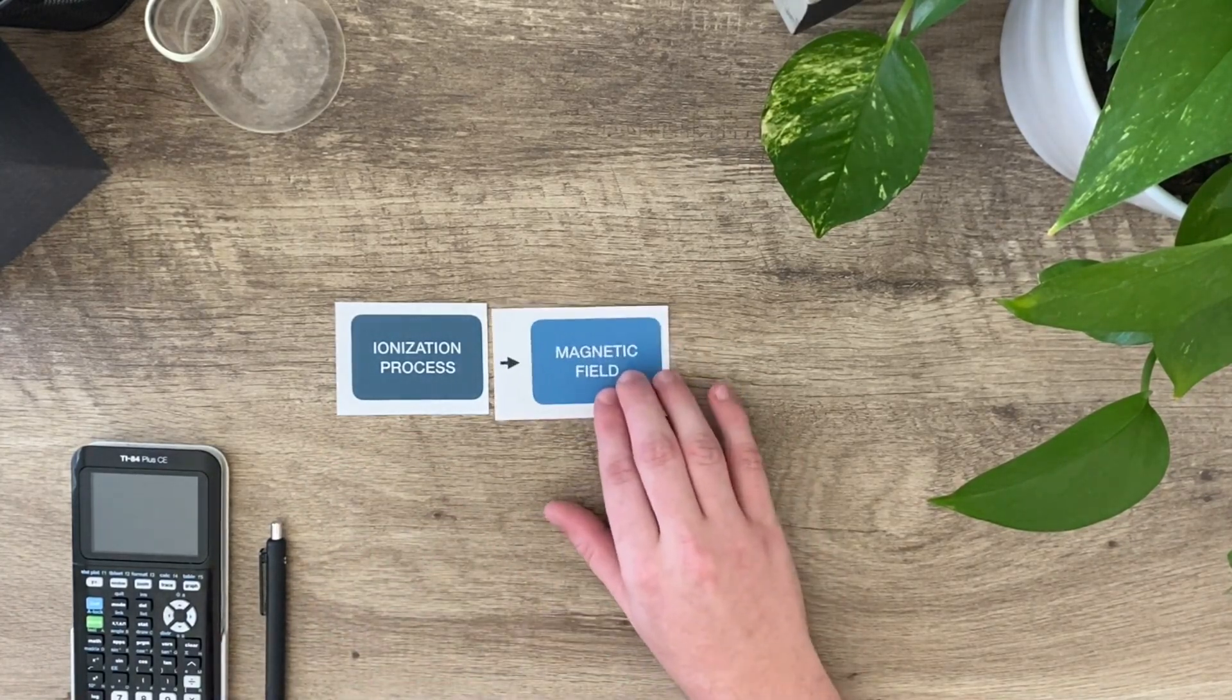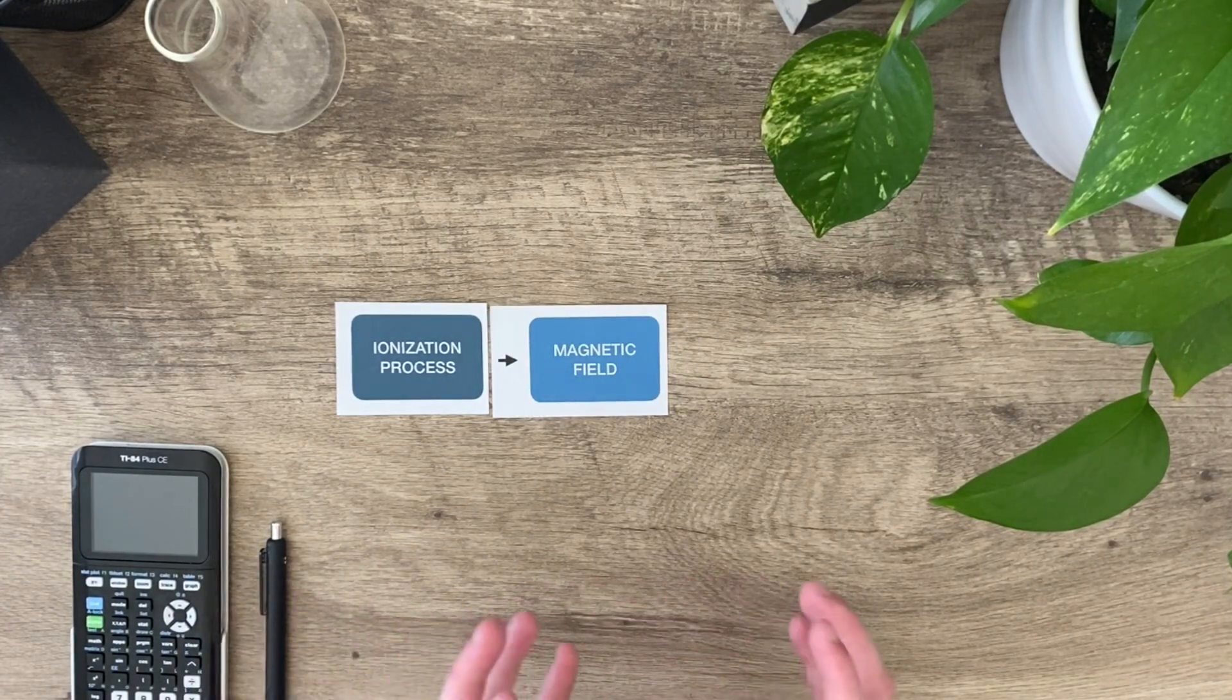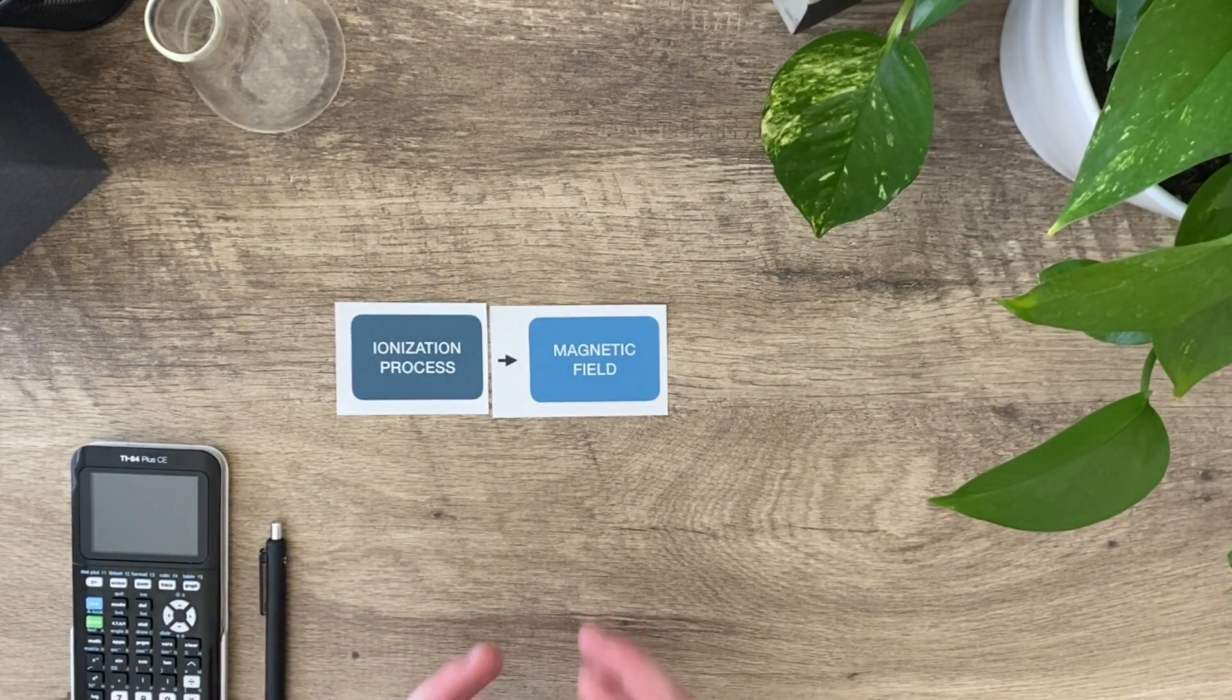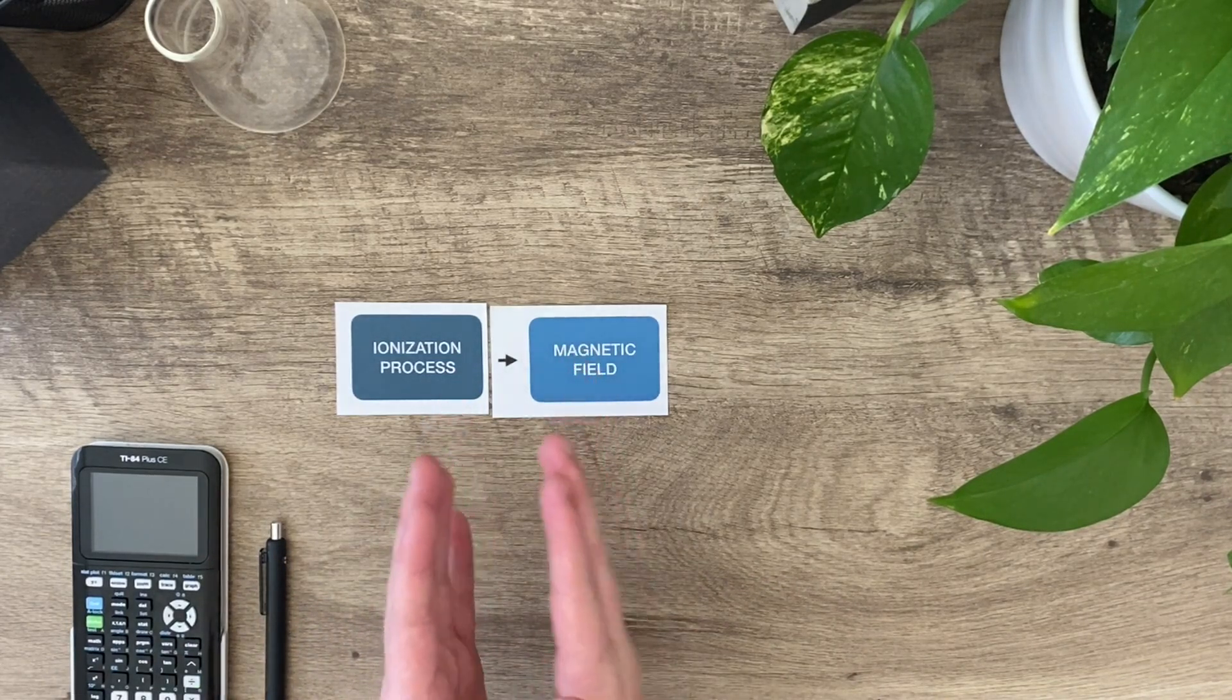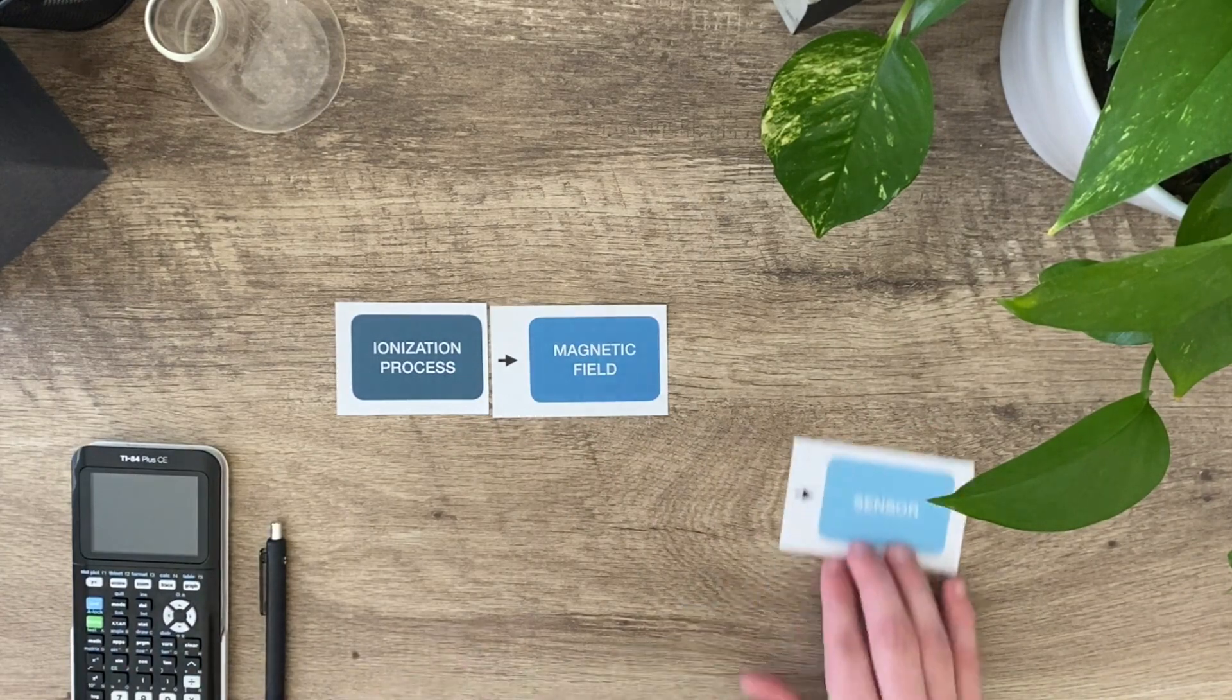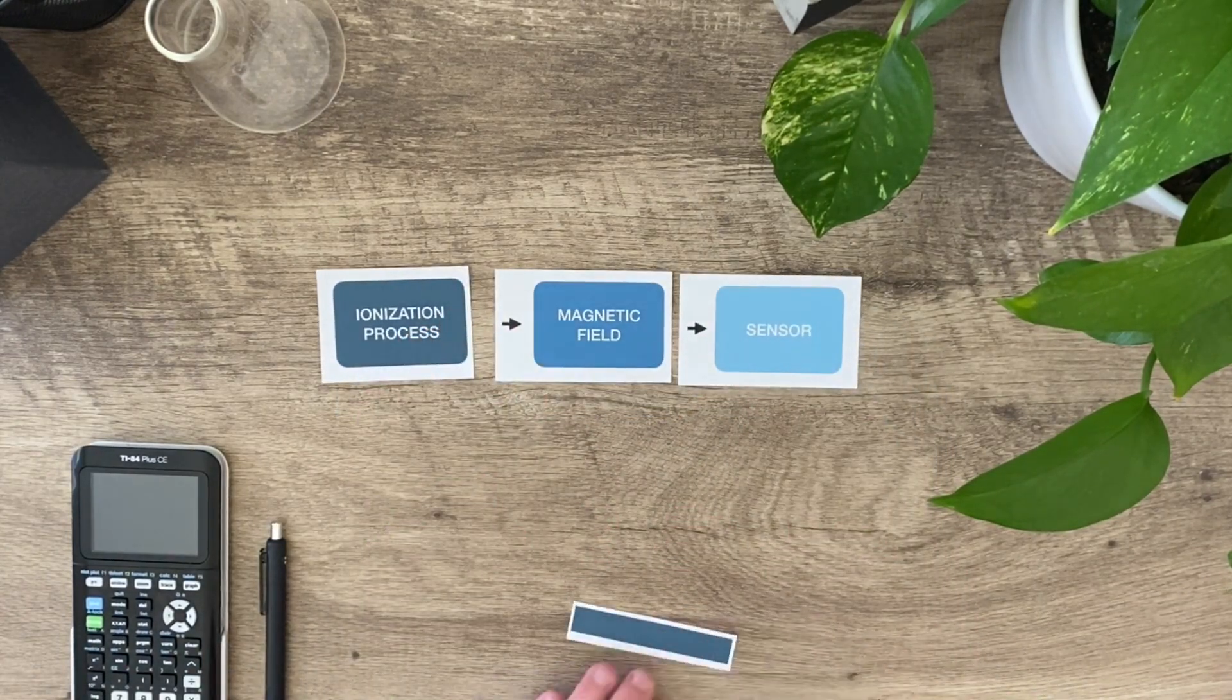The second part is that they're going to push those ions through a magnetic field, and the variation in that magnetic field causes the particles to sway left or right and deviate from the same path. Instead of all the molecules following the same path, they separate out and then they'll collide with a sensor.